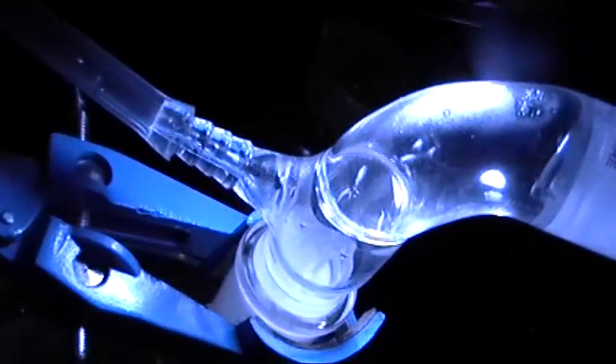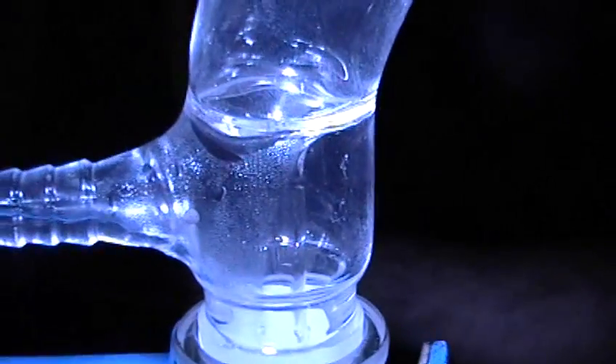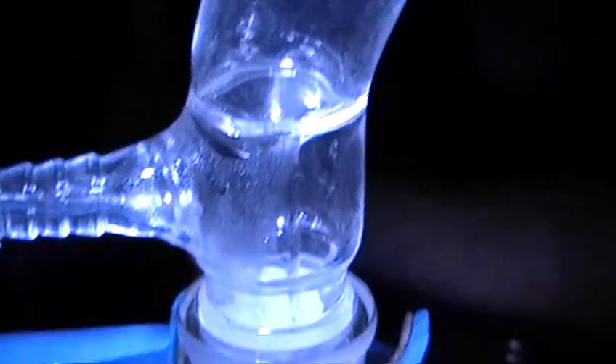As we look down at the condensing column, you can see that the mercury is indeed starting to collect inside. As we continue down into the angle adapter, it's starting to — on the right-hand side of the tube, you can see little droplets condensing.